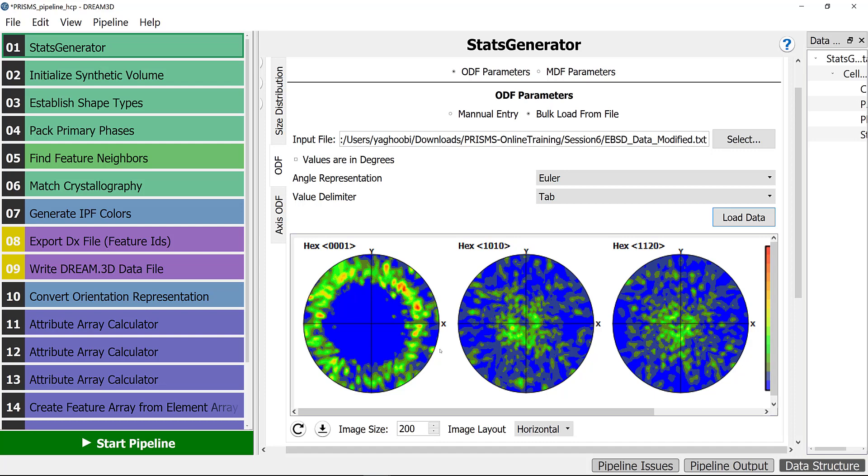This magnesium sample is extruded, so you can see that the extrusion axis is coming out of this 0001 pole figure. It has a weak basal texture.